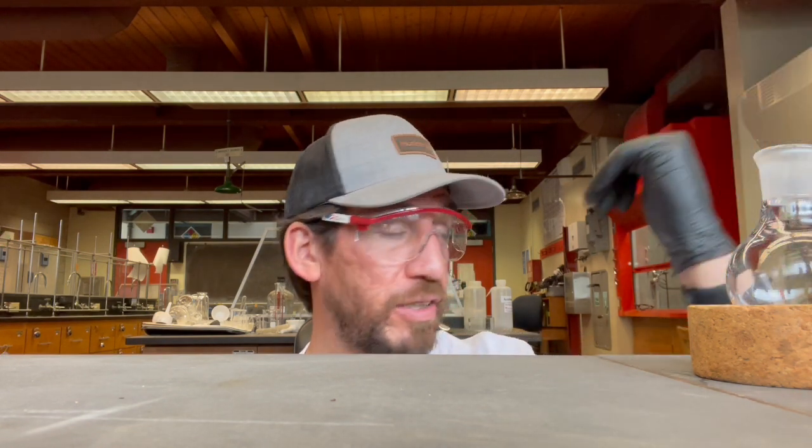Anyway, we got 5 mils. So that's 5 mils of decent percentage ethanol. As you saw, the volume of the fractions got larger and larger. That was intentional on my part because I know that the good stuff comes off first, and I also paid attention to the temperature. The temperature was starting to climb and climb, so I just swapped it out. If I really wanted to, I could distill a little bit more and collect all of that. I did actually collect a decent amount. I'm just not going to analyze it, but I could combine it with this and then distill it again.